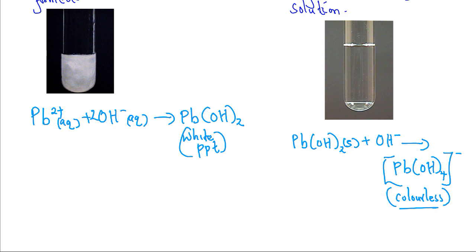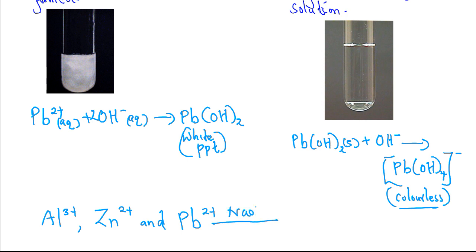In this case today, we have realized that aluminium ion, zinc ion and lead ion with excess sodium hydroxide give colorless solutions.